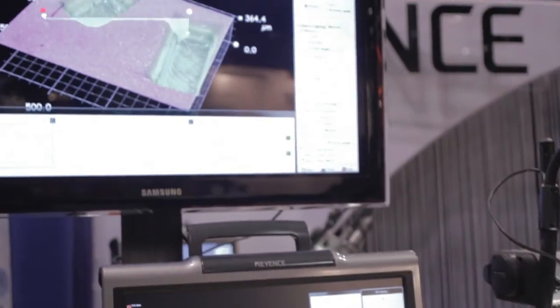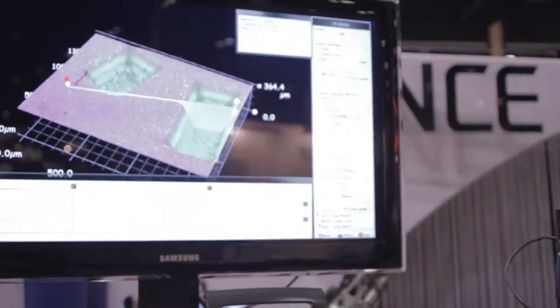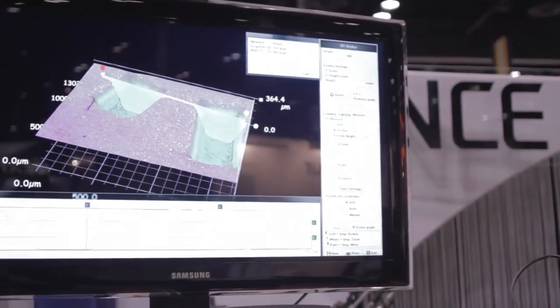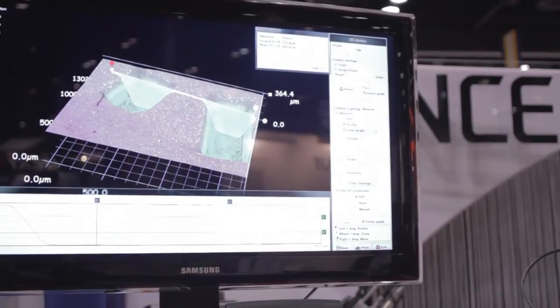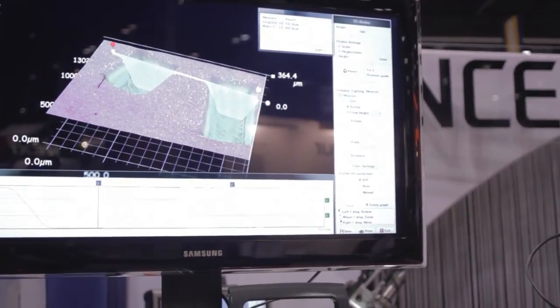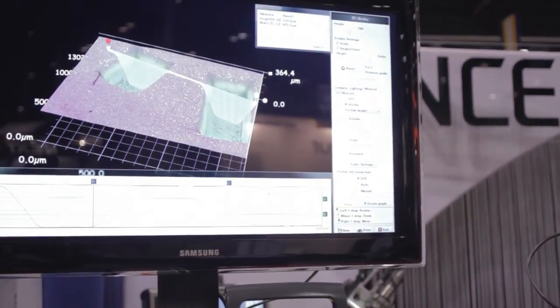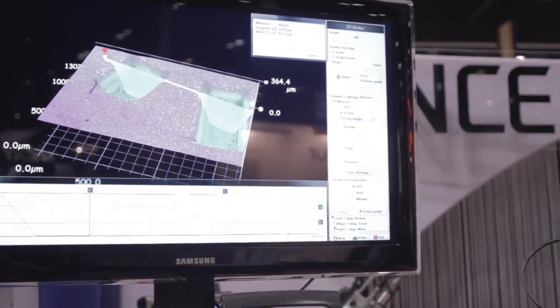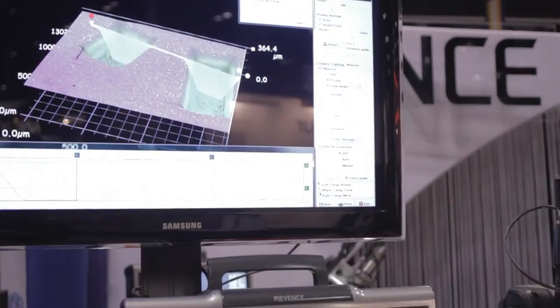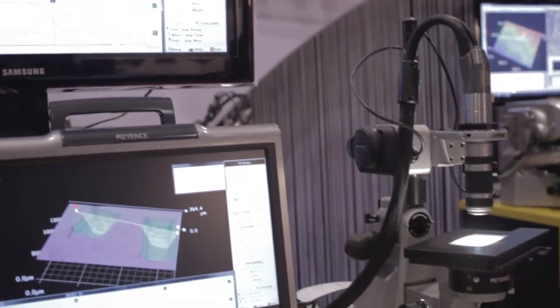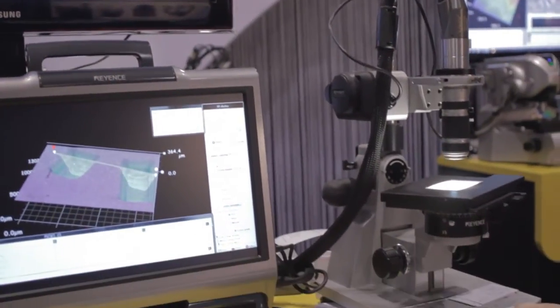So here I'm just doing a quick profile measurement across the top. You can see the graph on the bottom is displaying what that profile splices be. And you can manipulate on the side that A and B to get that height data of that pit.